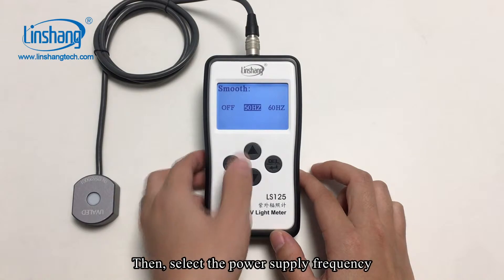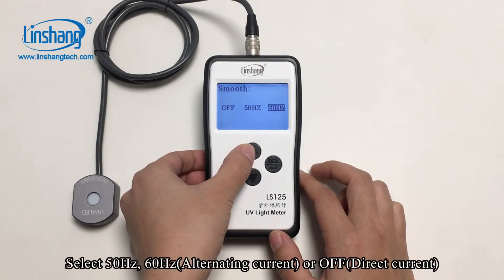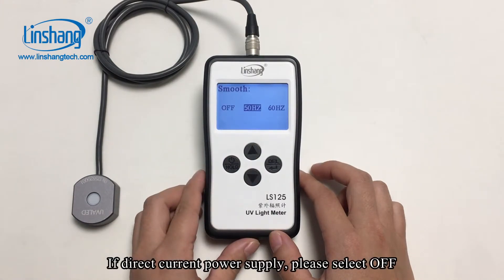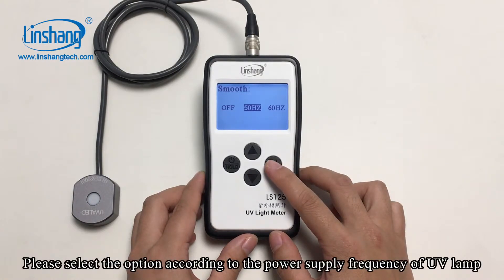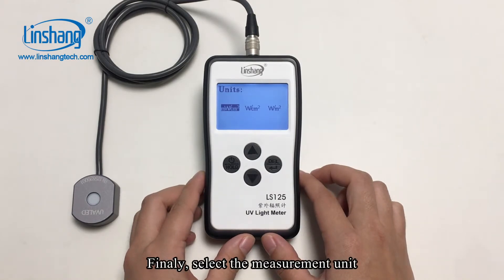Then select the power supply frequency: 50Hz, 60Hz, or off. If using a direct current power supply, please select off. Please select the option according to the power supply frequency of the UVA lamp.